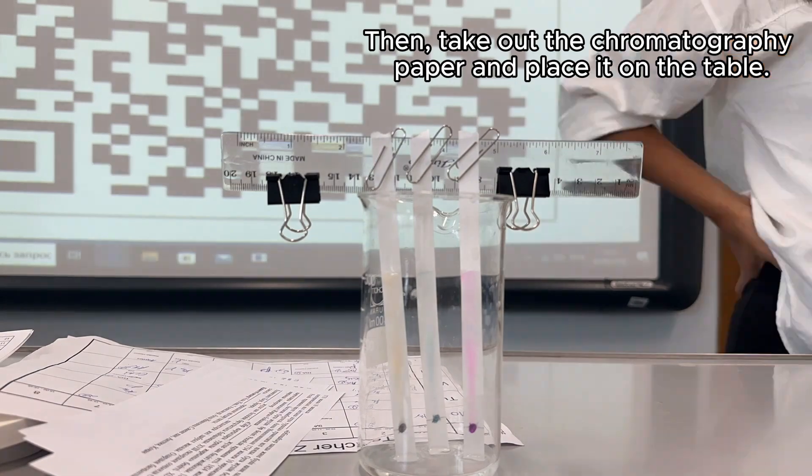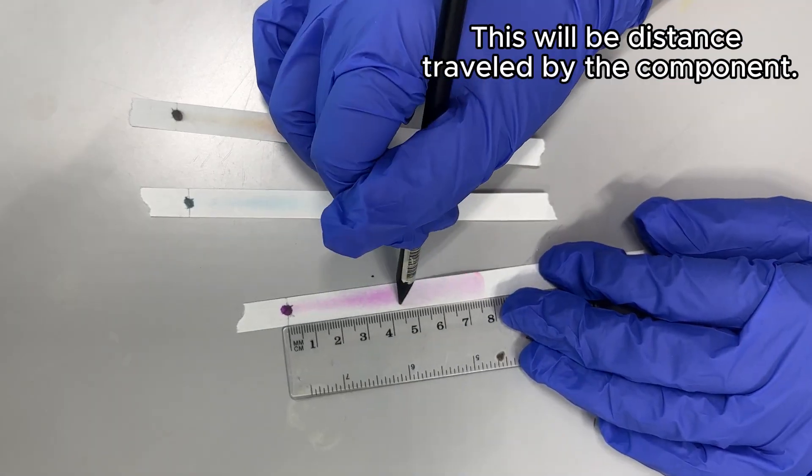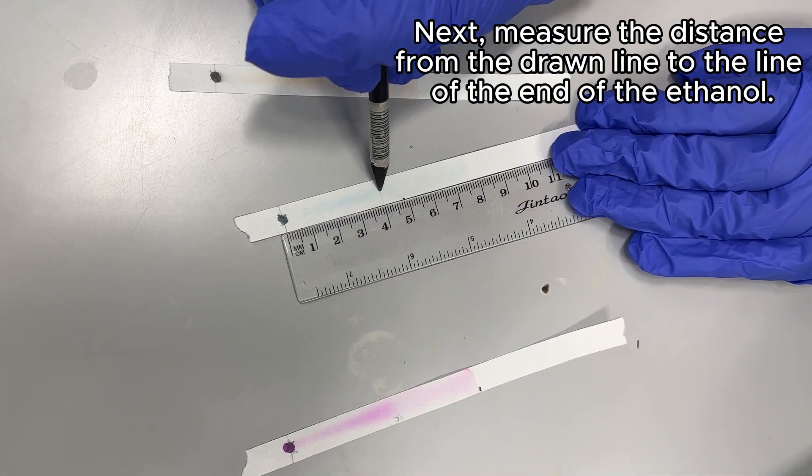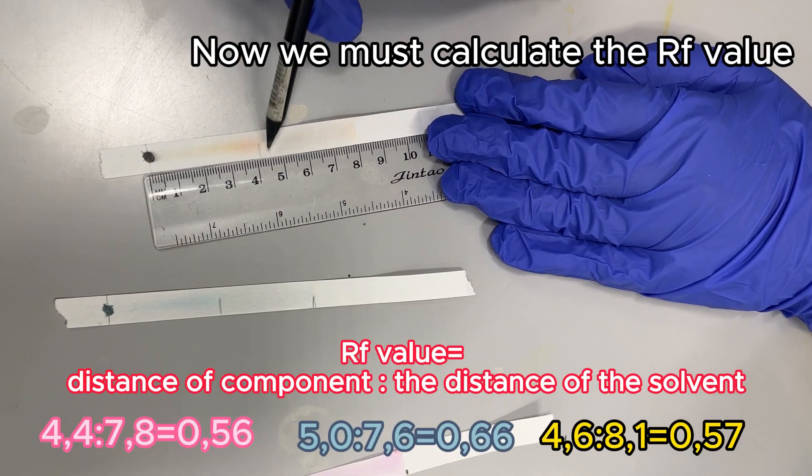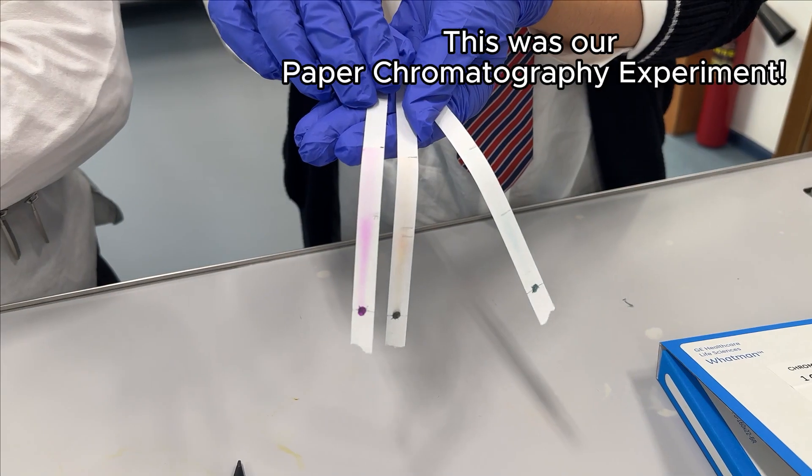Then, take out the chromatography paper and place it on the table. Using a ruler, measure the distance from the original drawn line to places where the pigment runs out. This will be the distance traveled by the component. Next, measure the distance from the drawn line to the line of the end of the ethanol. Now we must calculate the RF value using the formula below. This was our paper chromatography experiment.